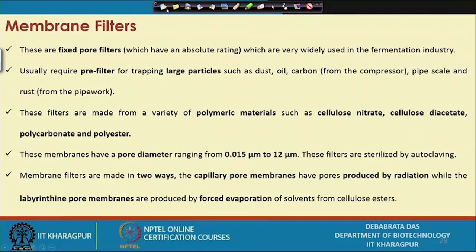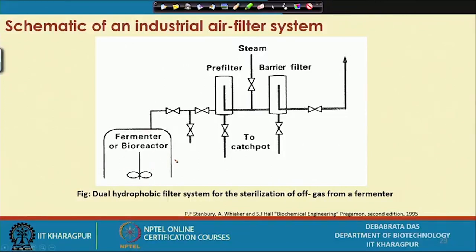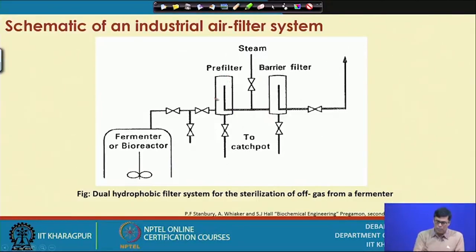So the only problem is that the life of the membrane is very short, and this is how the industry uses the filter. This is the fermenter, and we use some kind of pre-filter and pass this to the fermentation industry, we pass the liquid like this. Due to the hydrophobic filter system, the gas from the fermenter is sterilized as well. Whatever gas is going out, we sterilize it so that it does not contaminate the air.